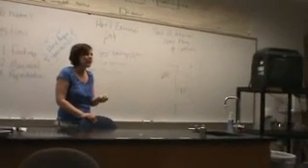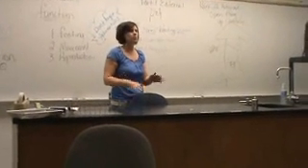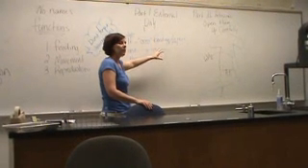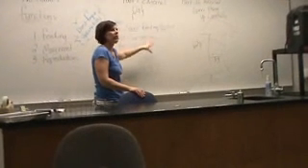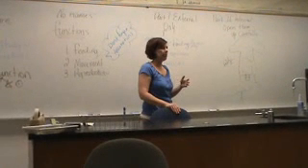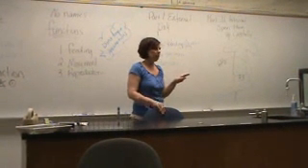But you're not going to be quizzed over, this is the heart, this is the brain, this is the eye. That's not the purpose. The purpose is the process of going through the scientific method in order to develop hypotheses about the functions of these organs, and then how you could test them, all that good stuff. So that's the focus of this lab. And the very last part, after you have them clean up, is you have to save 10 minutes to have them watch a video.